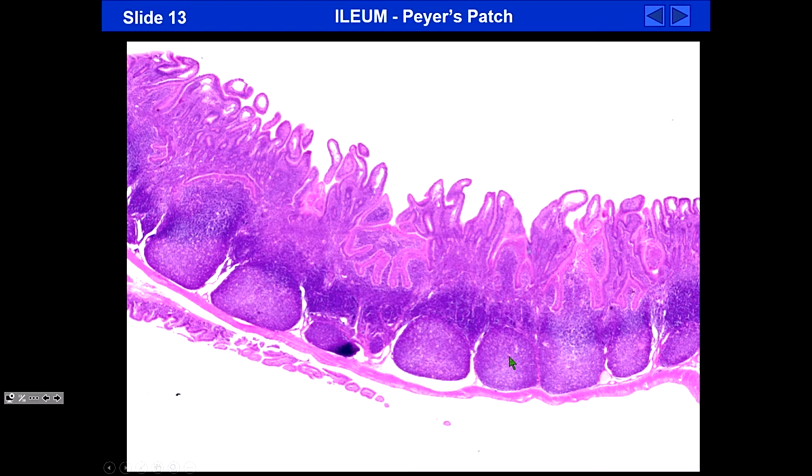No, it's underneath. So this is the lumen of the ileum. Here's the lining epithelium. Here's the submucosa out here. So it's all underneath. It's inside the body. Other questions?